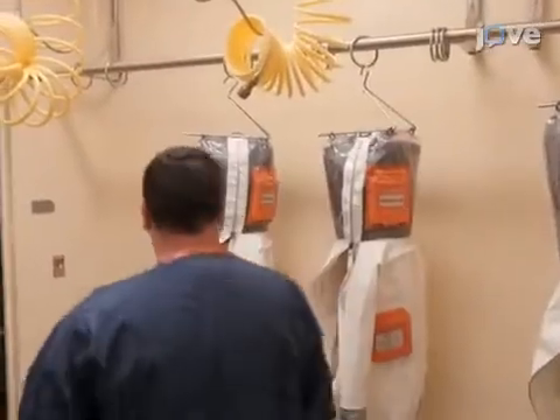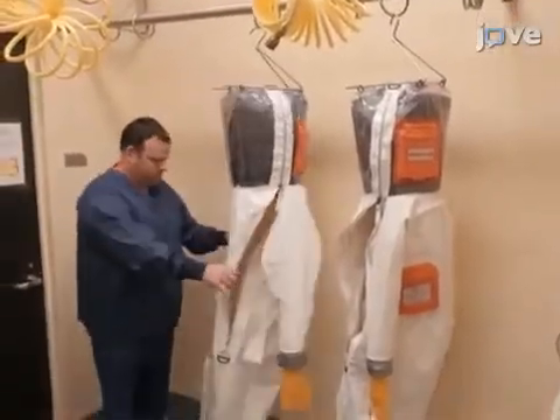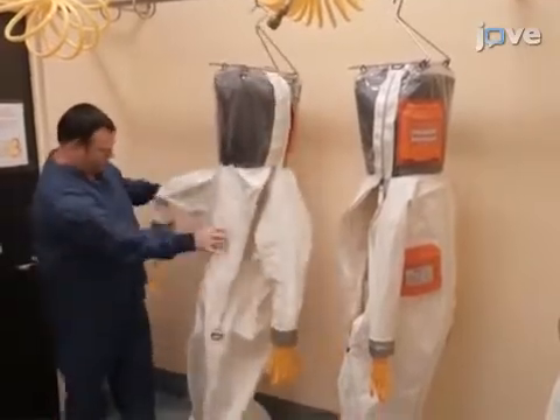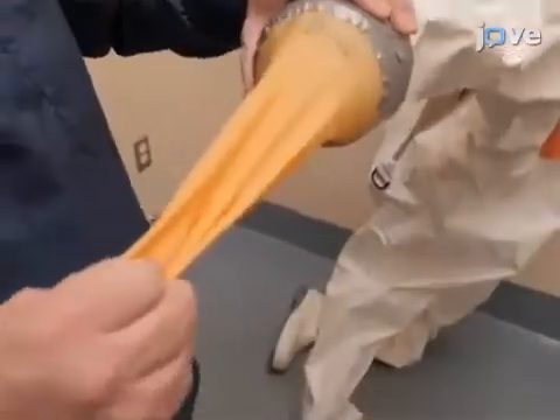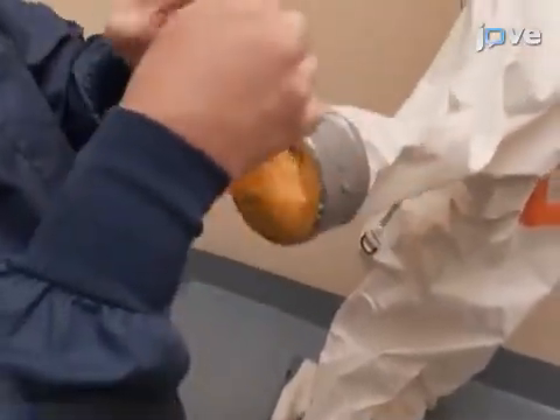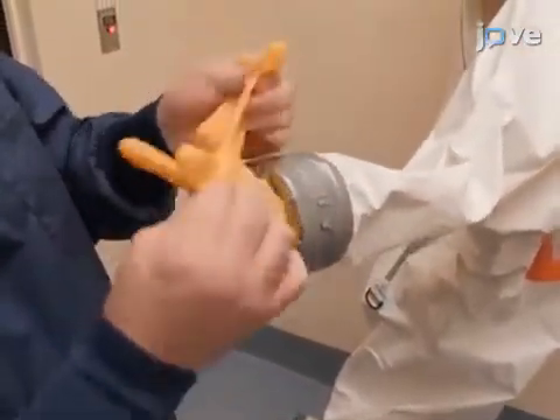Pick a positive pressure protective suit and visually inspect the suit for any holes, tears, puncture points, seam rips, or weak spots. Inspect the outer suit gloves thoroughly, since gloves are the most likely item to be damaged.